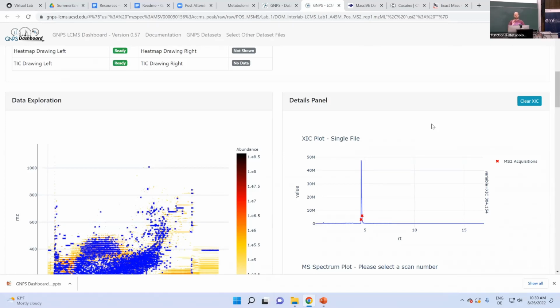And then now hopefully, as I update this with the correct mass, oh, I see a very nice peak. So at least from the chromatography side, that makes me happy, because that I would say is a pretty good peak shape.